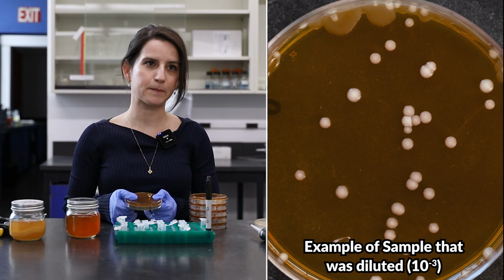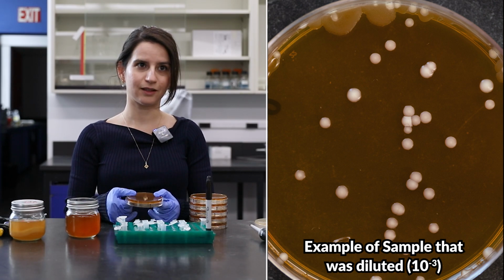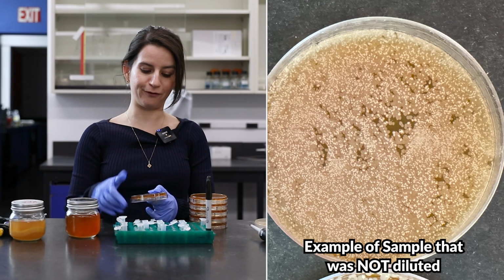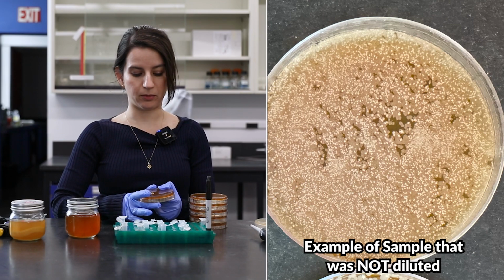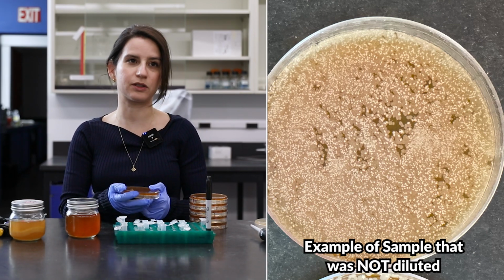If we didn't, we would essentially have so many colonies on the plate because there are still so many cells within that undiluted sample. You would just get a film, and you wouldn't be able to quantify how many cells are on there, which is one of the purposes of doing a serial dilution.